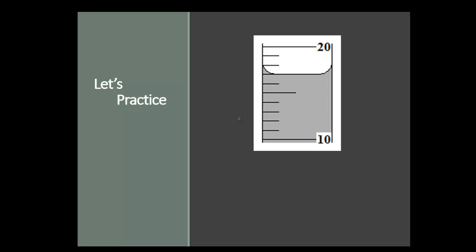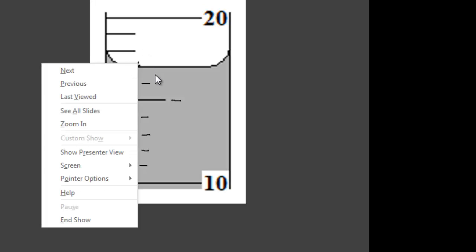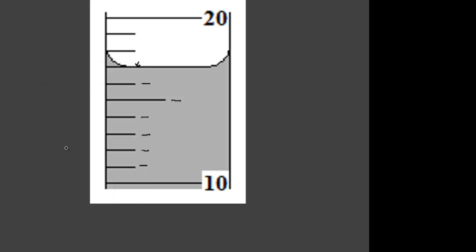So if we look at this time we're going to look at total number of lines. You can see that between the two we've gone up by 10 instead of by 1. So that's why the markings or the scale here is going to be different and why we don't have as many places past the decimal point. So if we're counting total lines, here I have 10, and I have 11, 12, 13, 14, 15, 16, and then let's say maybe 17. So our number is going to be 17.